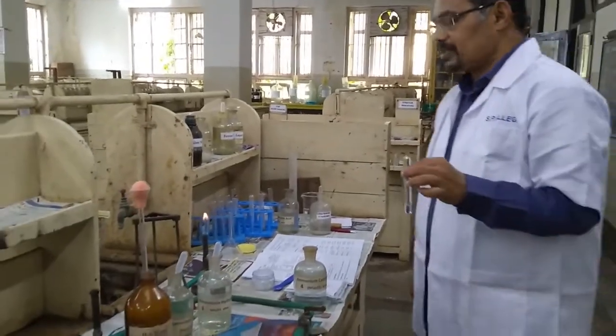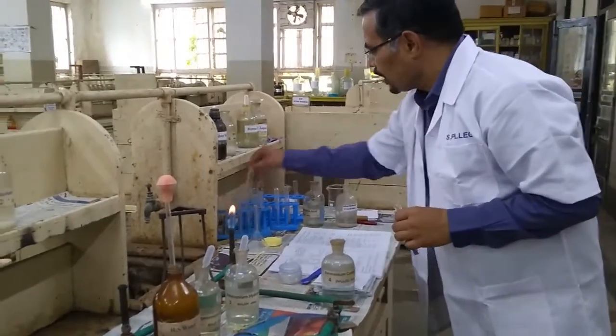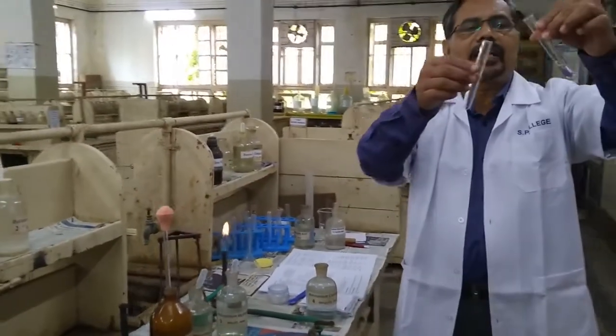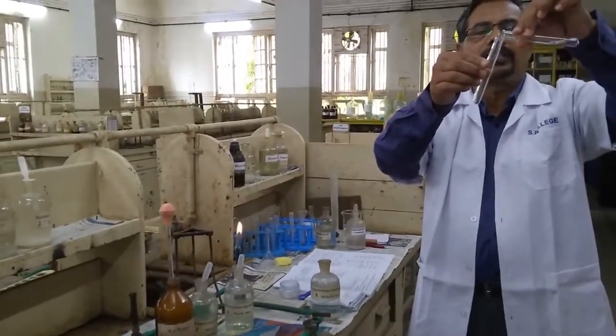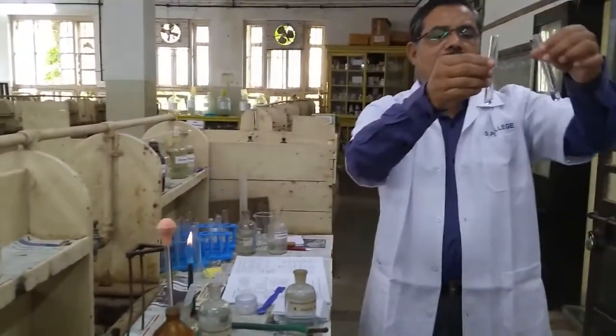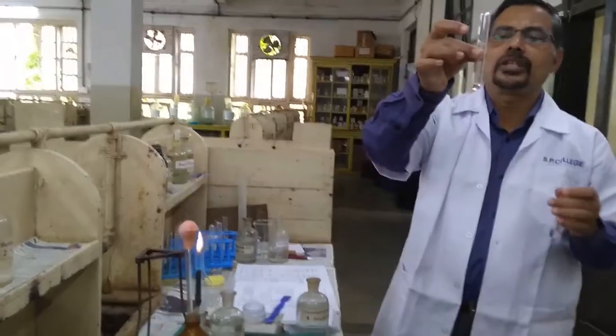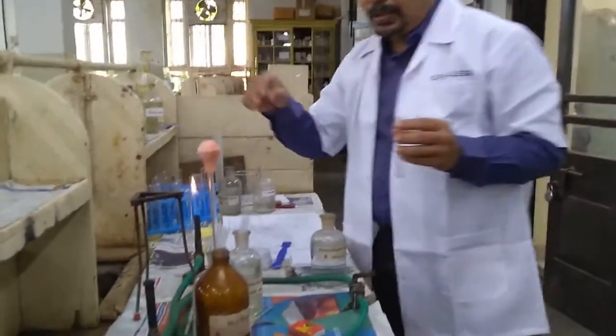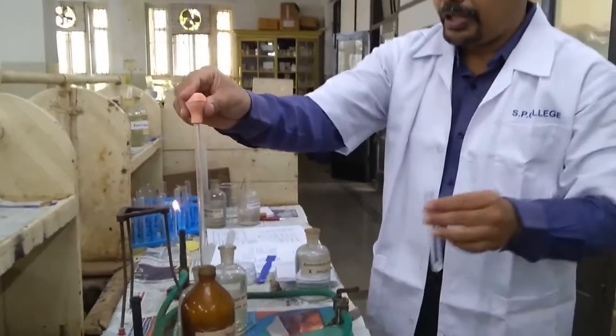Now the next test, for the presence of group 3B, I will take a small quantity of this alkaline solution for the group 3B test. I will take this H2S water in this.